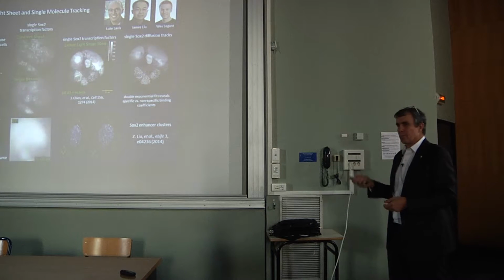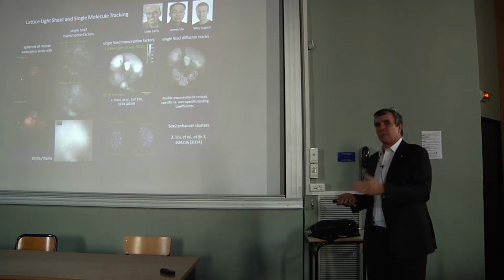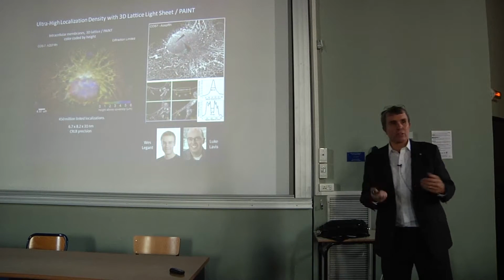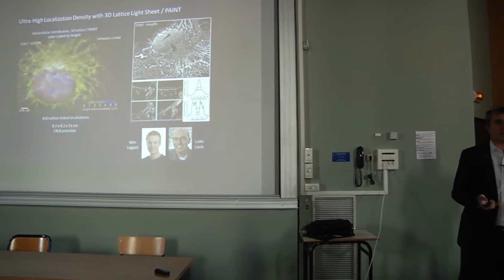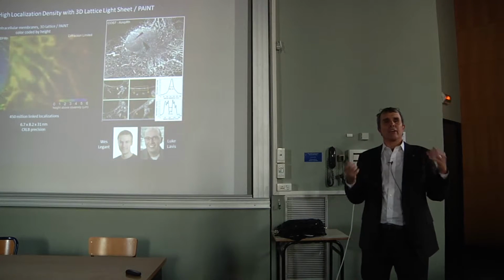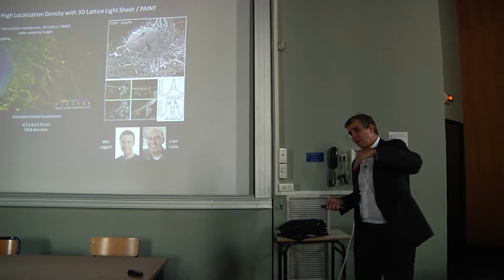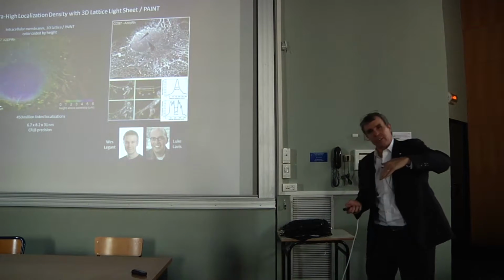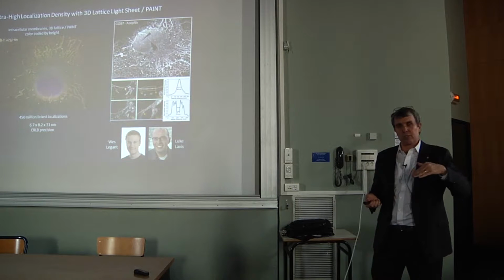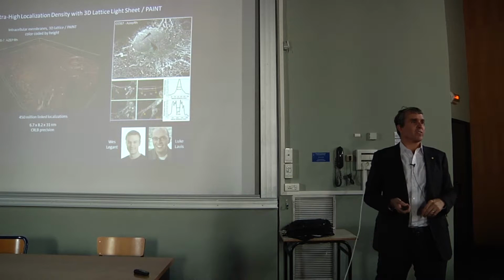In a couple of studies, we used this to study the transient kinetics of the binding of transcription factors, both specific and nonspecific, to DNA. Now what we can do is use our lattice light sheet to get around the problem in PAINT of the whole media glowing, and look at one plane at a time, do our PAINT there, go to the next plane, do it again, go through the whole volume of the cell, then come back to the beginning, because new molecules will have bound out of the solution. You do it again and again, hundreds of thousands of times.